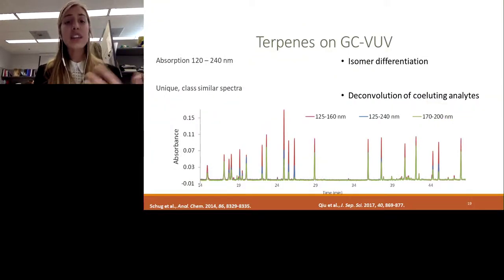And even this one is actually a work in progress. So you will see in here the first chromatographic separation that we obtained, that is 45 minutes. We are actually fastening it to 10 minutes. And we are even trying to get the best extraction technique, because this is actually what is extremely challenging about terpenes analysis. There is not a validated, efficient extraction method. So there are different extraction methods, but none of them has been reported to be perfectly suitable for each type of application.